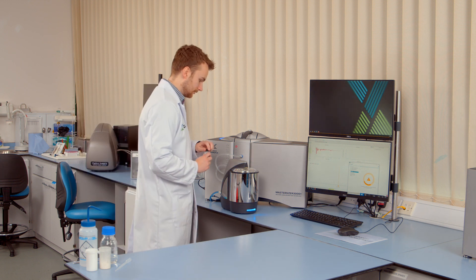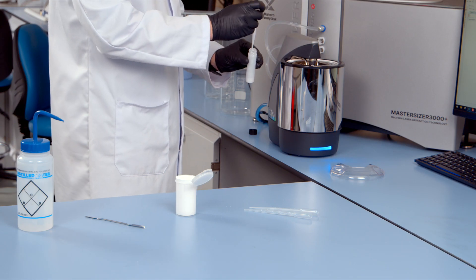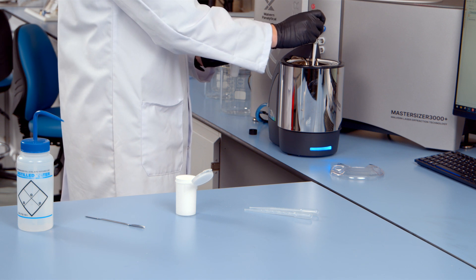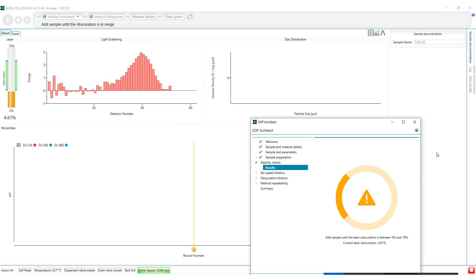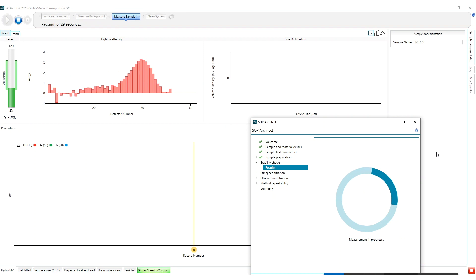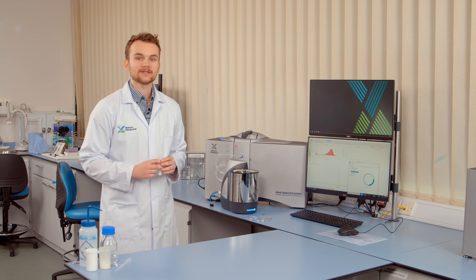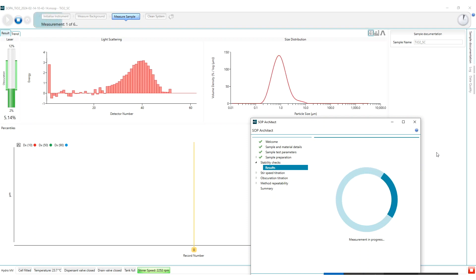So now that the laser has been correctly aligned and the background measured we can now add the sample until we reach the desired obscuration value. Once we've got into this green zone there will now be a pause of 30 seconds to allow the material to disperse before we'll carry out a series of six measurements to help determine the sample stability.